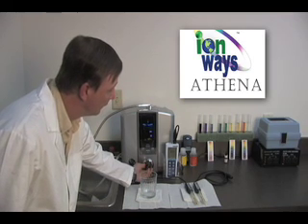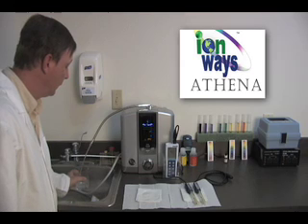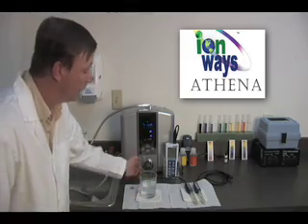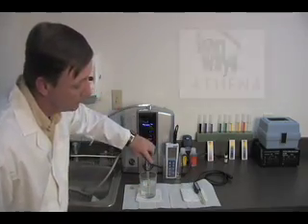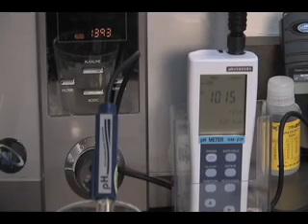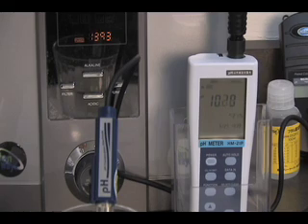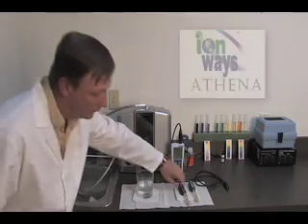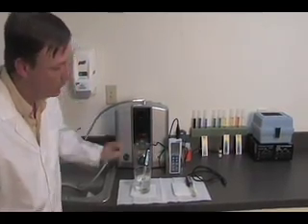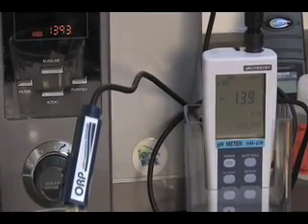The tests will begin with the IonWays Athena. First, we will test the pH level of the water sample from the Athena. The pH level for the water sample for the Athena reads 10.20. Now we will test the ORP level of the water sample from the Athena. The ORP level for the water sample for the Athena reads negative 139.